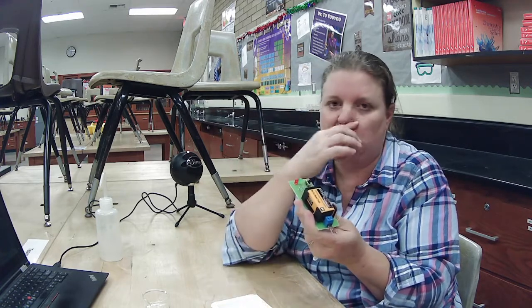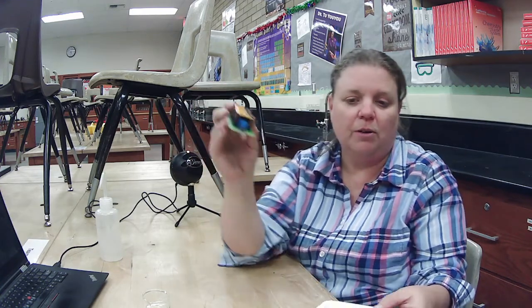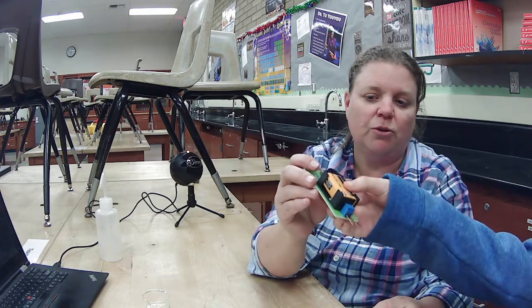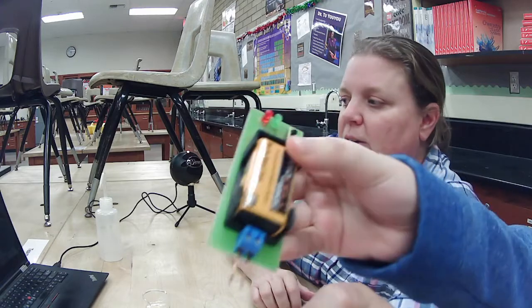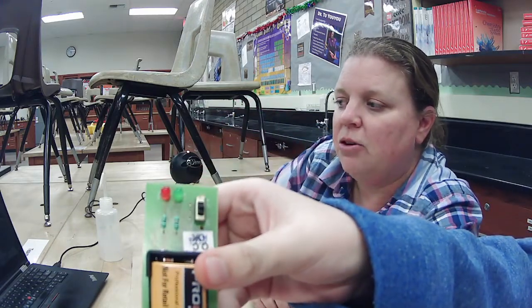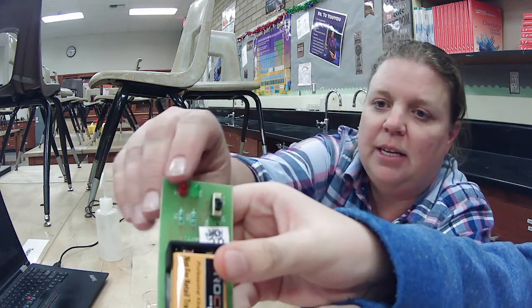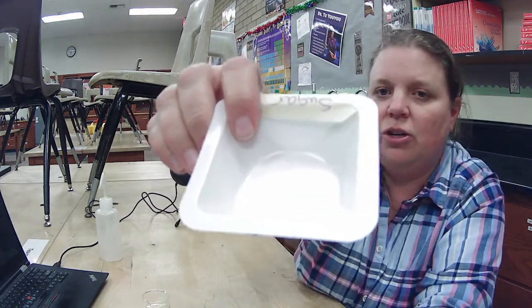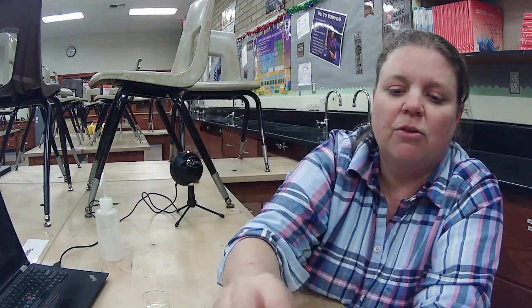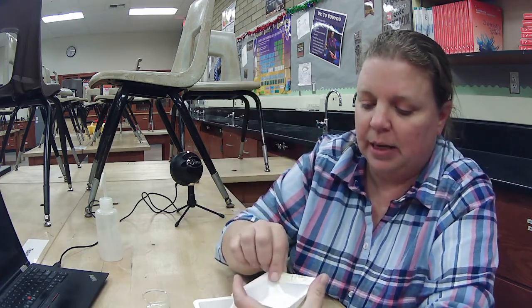Josie's here to help me. All right, Josie, are you ready? We're going to do sugar first. You want to hold this in the sugar. I'm going to hold this up to the camera, and she's going to put it in there, and you're going to see if it lights up. Notice you have no light. So this has absolutely no conductivity. This is just solid sugar. Sugar is a covalent bond, and so it does not conduct electricity as a solid.